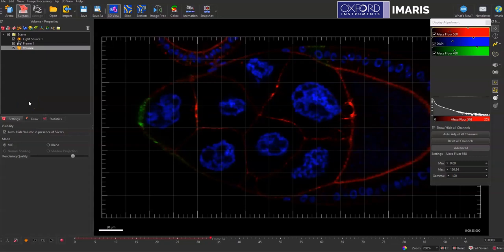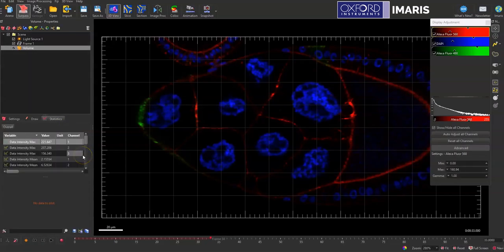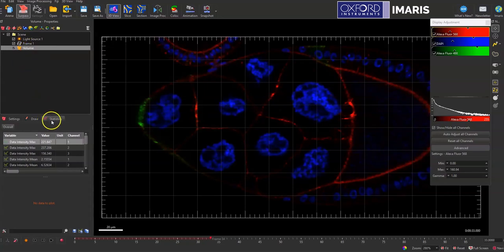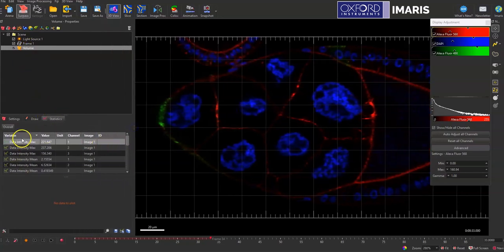Or if I just want to measure the signal intensity across these different time points or rather the different Z planes, I can do that here in the volume option by selecting statistics and then measuring the different intensity statistics that are available.